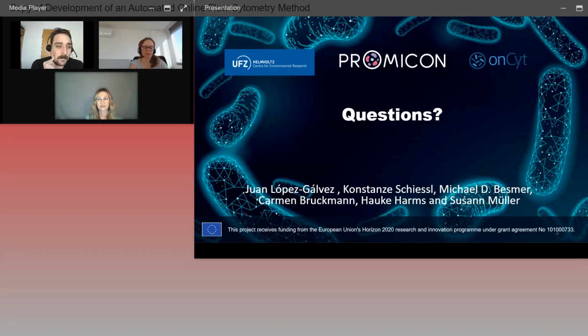So you can use it with other flow cytometers, not with any. It's always about coupling different machines, and the Cytoflex has a very nice interface to use with our system. Among the flow cytometers you can use with our system, the Cytoflex has the biggest visual capacity, in terms of channels and combinations. But in principle, you could also use it with another one.